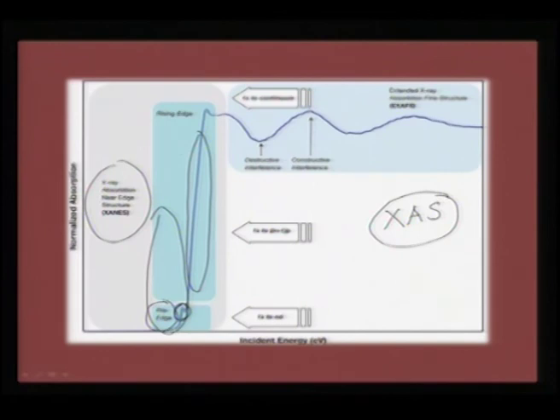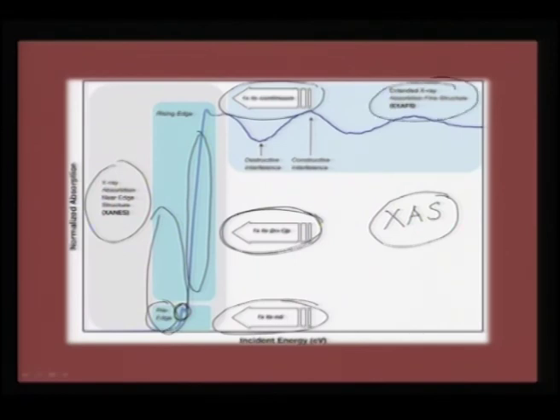This is the region where you have the transitions happening between 1s to n plus 1 p level, or it could be p to n plus 1 d level. So, this region takes care of such bound states, and this is the region where you can talk about the pre-edge. And if the 1s electron is knocked out into the continuum, or if the knocked out electron is well within the continuum, then you talk about the extended X-ray absorption fine structure.